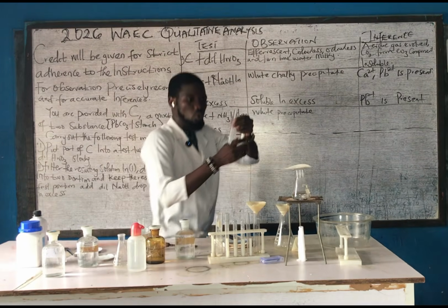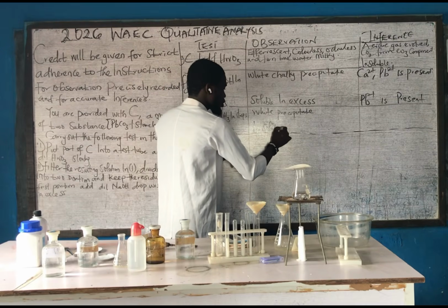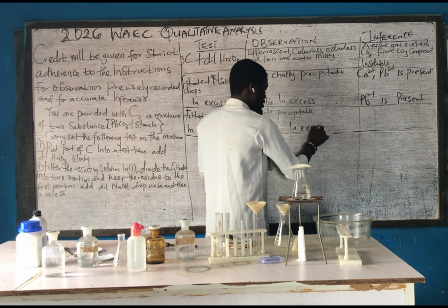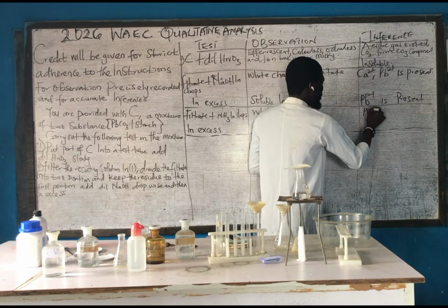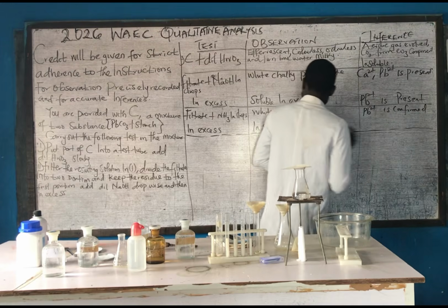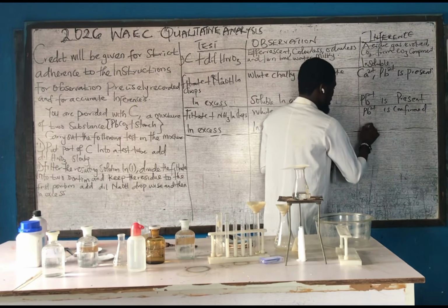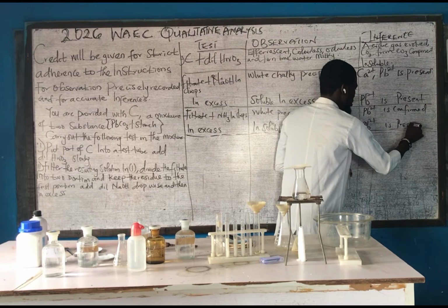So, insoluble in excess. If you have it in drops, we have our lead 2 is confirmed. Insoluble in excess, lead 2 is present.